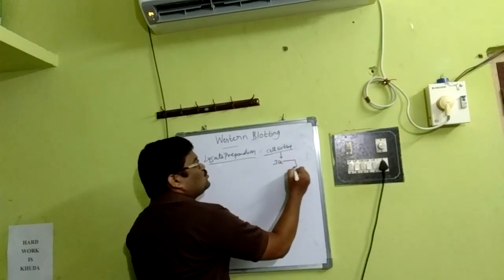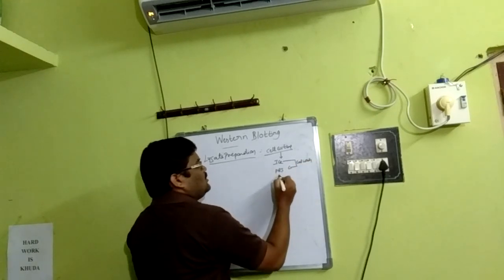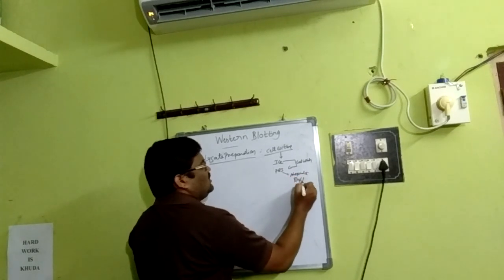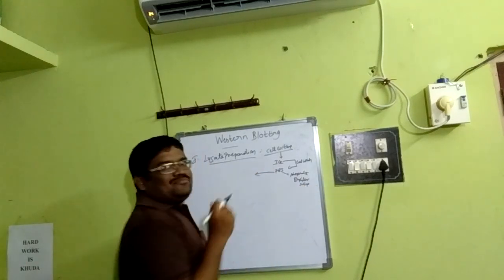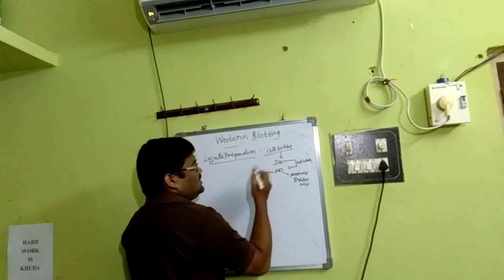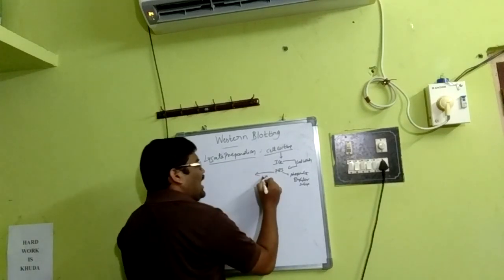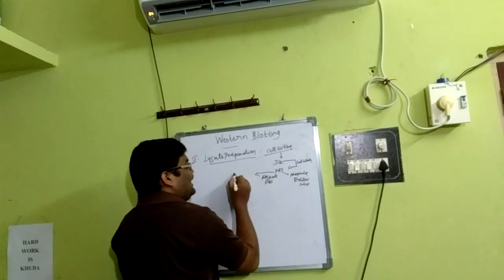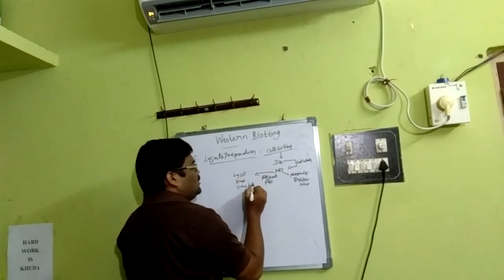Then subject the same to a cold wash by PBS, phosphate buffer saline. After that, we have to subject the same to lysis buffers. After washing, we have to suck off and remove the PBS component, what we call aspirate. Aspirate PBS.